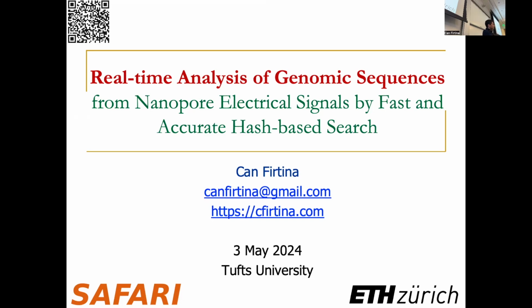For the first question, I already told you that it's exact matching based, but we have this work that we call BLEND, which I presented last year at RECOMB also. The question over there is, given a k-mer or a sequence of a certain length, can we generate the same hash value if a pair of sequences are similar enough to each other?